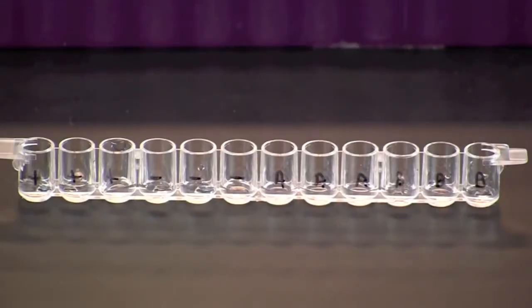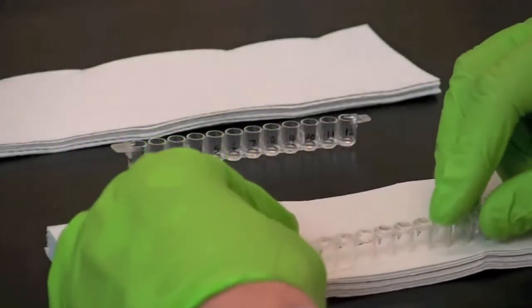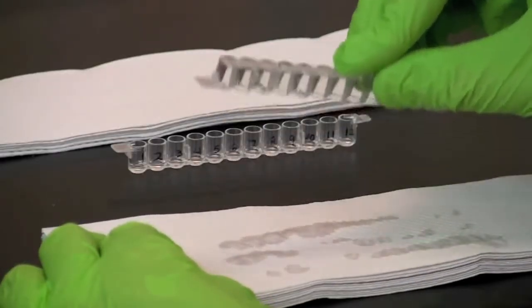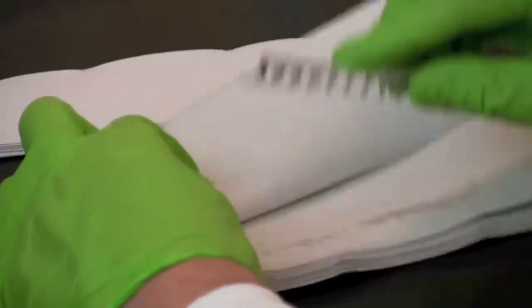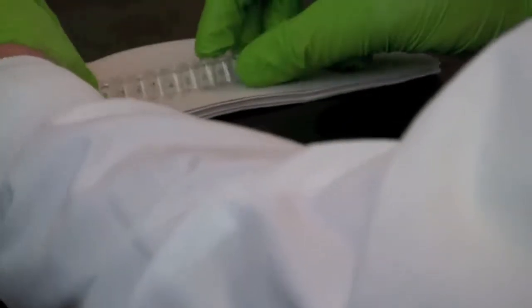Incubate the samples for 5 minutes at room temperature so that the antigen can bind to the plastic wells. Tip one of the microplate strips upside down onto a short stack of paper towels and gently tap the strip a few times. Make sure to avoid splashing sample back into the wells. Take the other microplate strip and repeat the procedure as you did with the first strip.